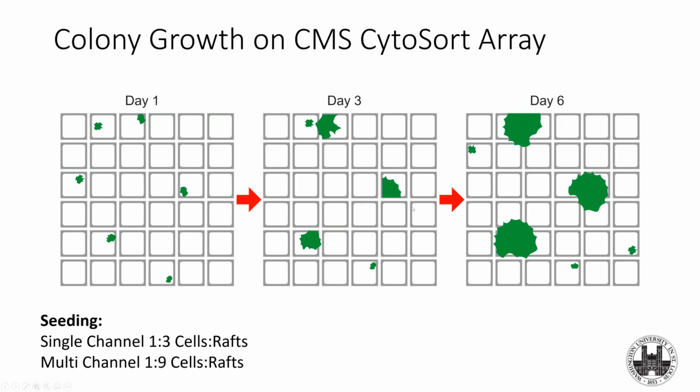And so, like Jacquelyn said, you can watch this happen over time, and so you can confirm that, okay, that large colony here actually arose from a single cell, whereas this one on the top probably arose from 2 cells, so we won't pick that.